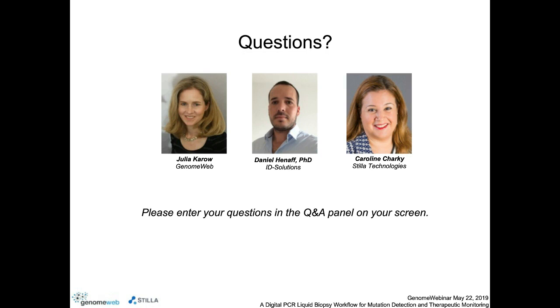Okay, thank you. Caroline, do you think if next-gen sequencing gets cheap enough, it will actually replace digital PCR, or do you think it will be staying for a while? Or the other way around, will digital PCR replace NGS? Well, NGS is widely the gold standard right now, and a very widely adopted methodology and technology. We think digital PCR is complementary to NGS, so it will not replace NGS, not now anyhow.